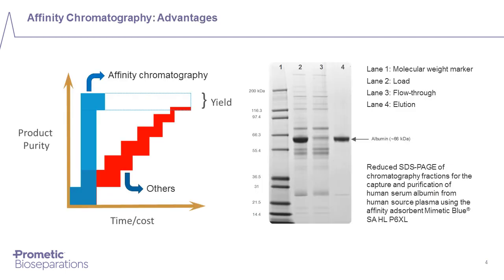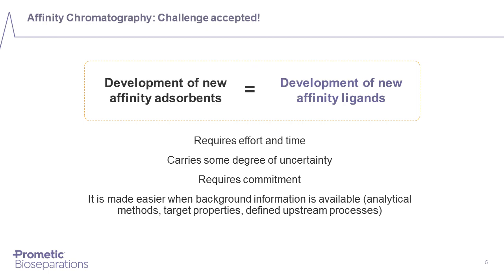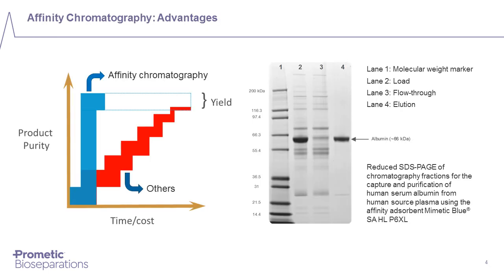So what is the biggest drive of affinity chromatography? Typically people look into affinity chromatography because you have the ability to resolve complex problems in bioseparations using fewer steps than if you use non-specific chromatographic or other steps.